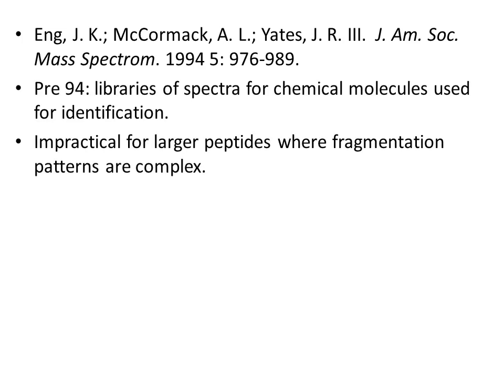Prior to 1994, mass spectrometry was not being widely used for characterizing peptides, but when it was, it relied on a database of spectra to match patterns. This approach has been used since the early 1980s to characterize simpler chemical molecules, and is still the identification method of choice for those working on small molecules.